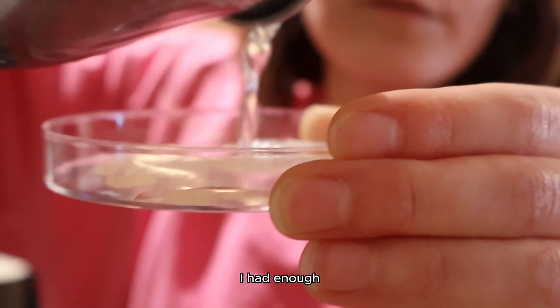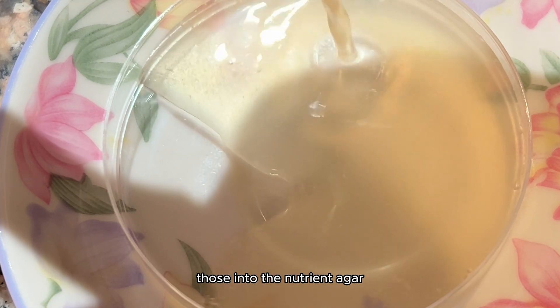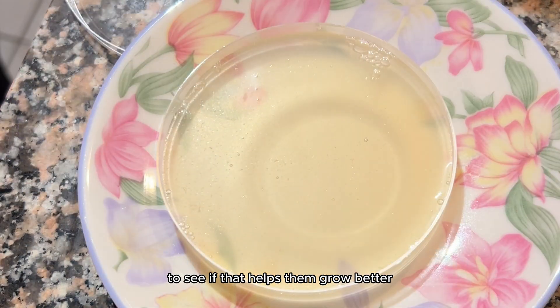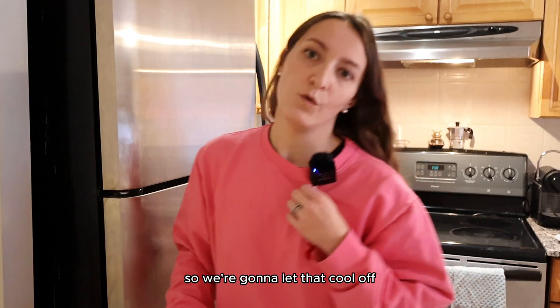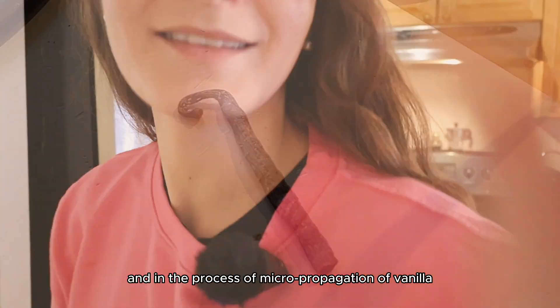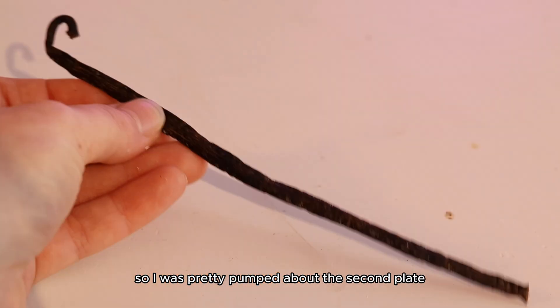I had enough for two plates. On one plate, we could add the seeds right on top without mixing them into the nutrient agar, and with the second plate, we could try pushing the seeds into the gel to see if that helps them grow better, or even counteract any mycelium or mold that infiltrates our vanilla home — since we didn't add any other vitamins into the mixture. In the process of micropropagation of vanilla, you're supposed to push the seeds into the gelling agent in order for them to grow, so I was pretty pumped about the second plate.